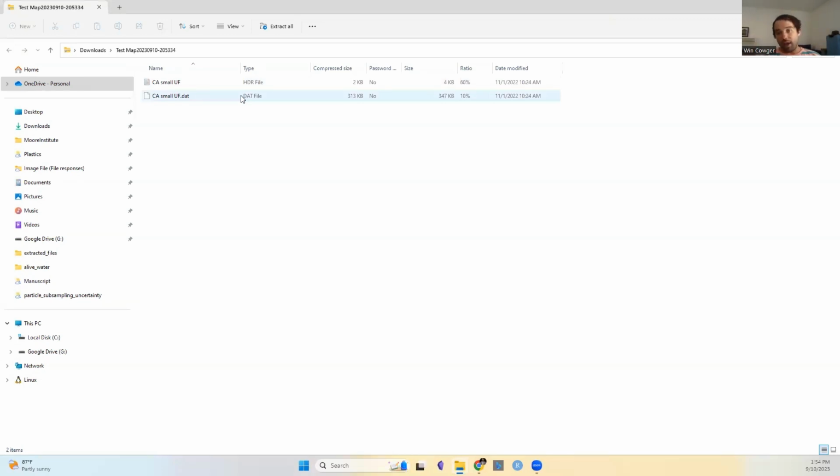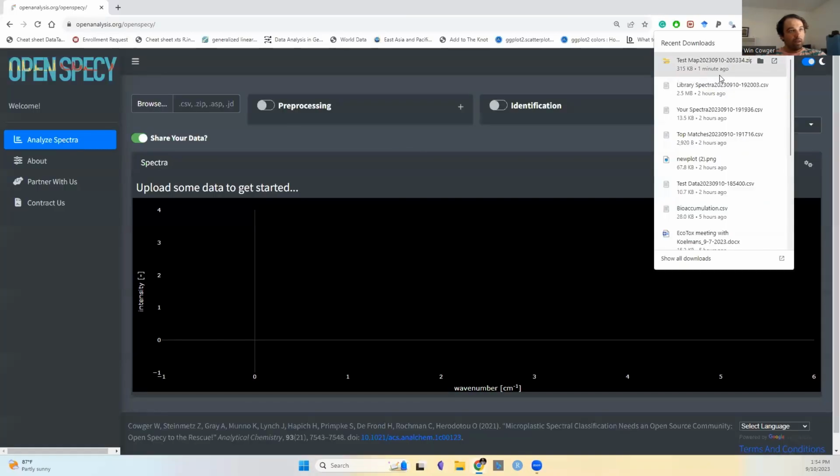I'm not going to go over that type of analysis too much in this tutorial because that was already covered in the quick tutorial, and this one is really going to take a deeper dive, and a lot of the ideas cross over too. So this is what the test map looks like. And we're going to upload that.